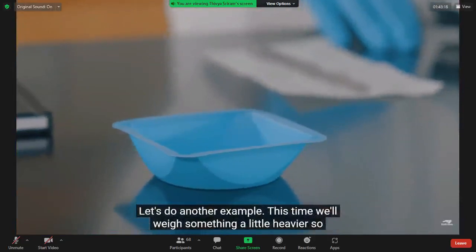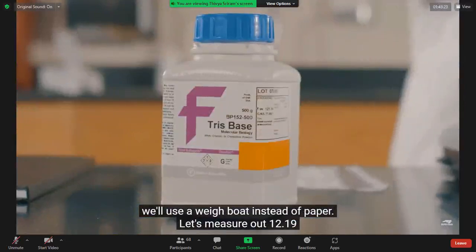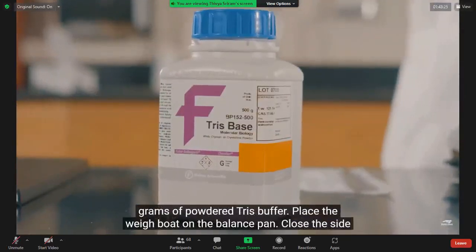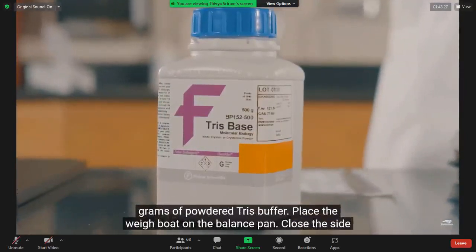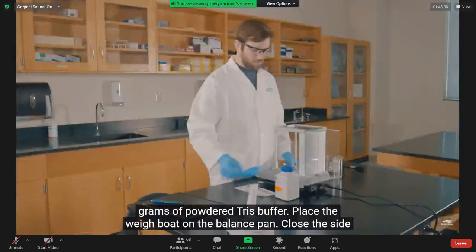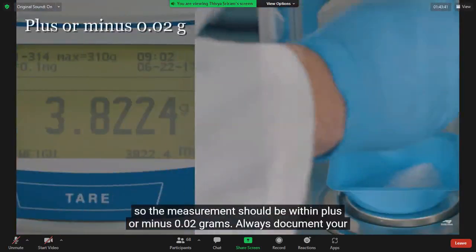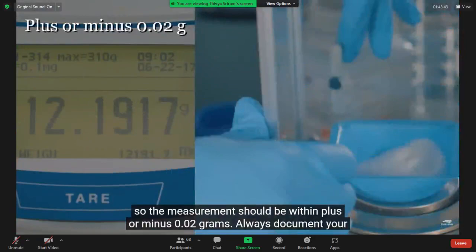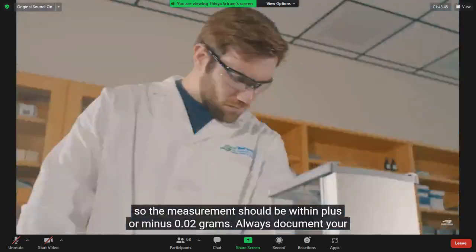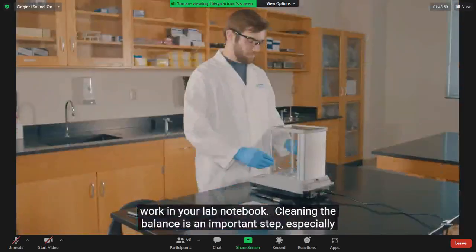Let's do another example. This time, we'll weigh something a little heavier, so we'll use a weigh boat instead of paper. Let's measure out 12.19 grams of powdered tris buffer. Place the weigh boat on the balance pan. Close the side doors and press the tare key. We're aiming for 12.19 grams, so the measurement should be within plus or minus 0.02 grams. Always document your work in your lab notebook.